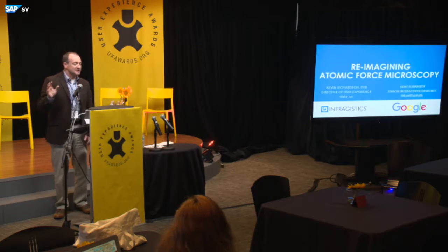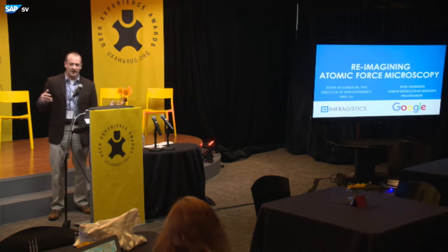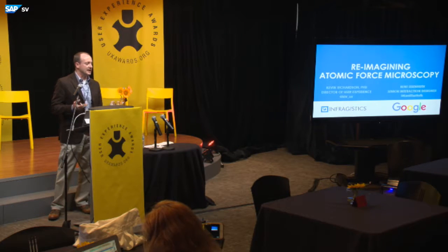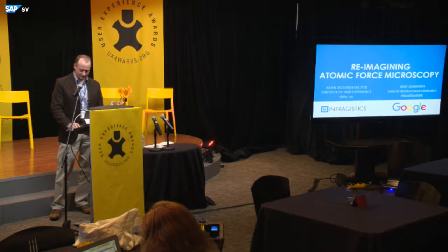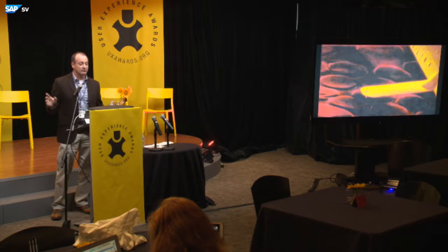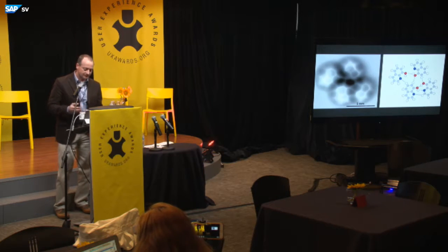I'm talking today about redesigning the software that controls atomic force microscopes. A company called Keysight, one of the leading manufacturers of test measurement software, called us and asked us if we could help them redesign this software on this very expensive equipment. It essentially measures and takes pictures of really small stuff like red blood cells, or even the bonds between atoms.